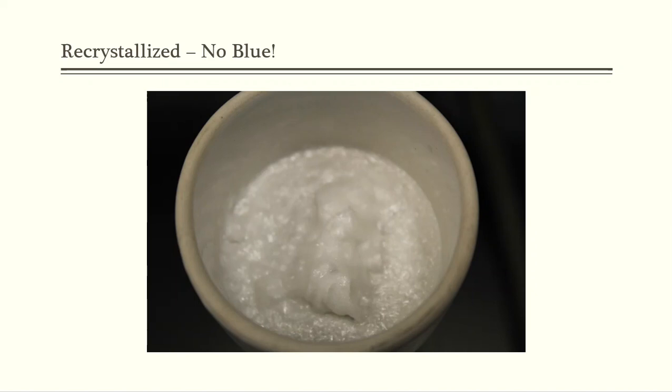So these crystals are basically now on top of my filter paper. I allowed air to pull through that for a couple of minutes just to get all of the residual water out that I could.